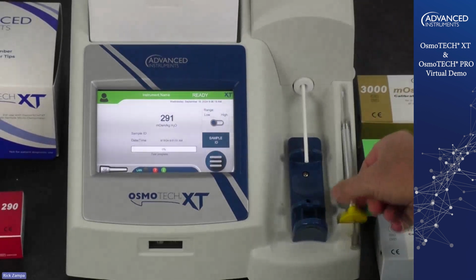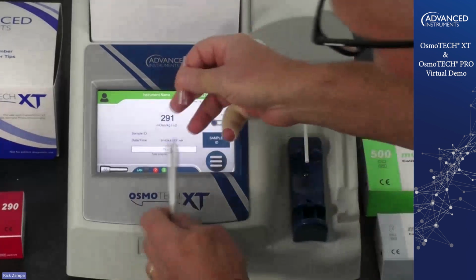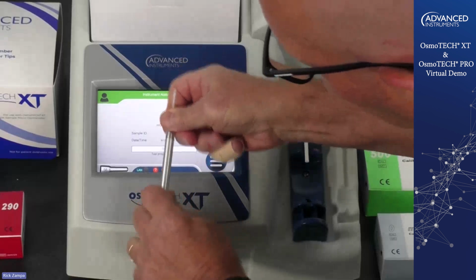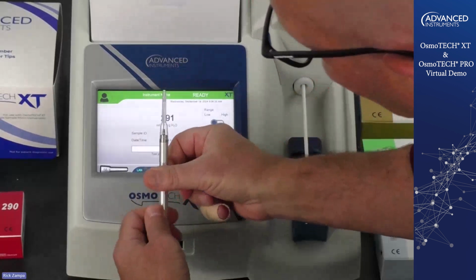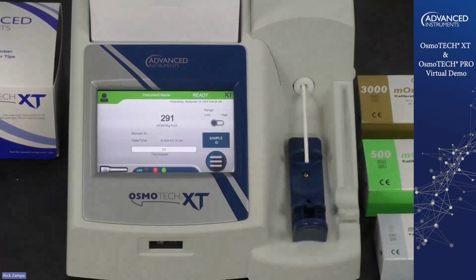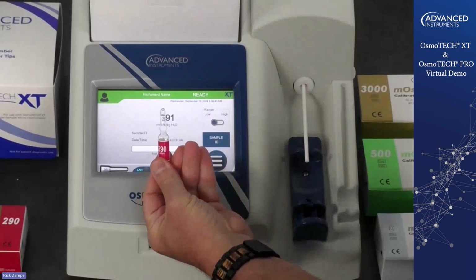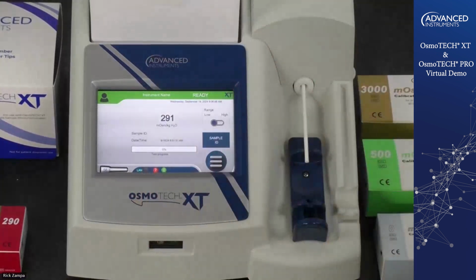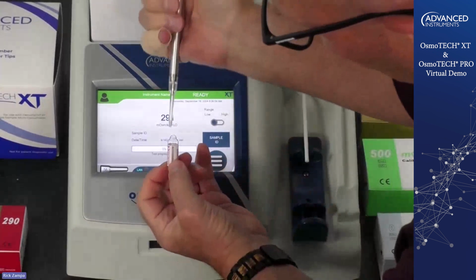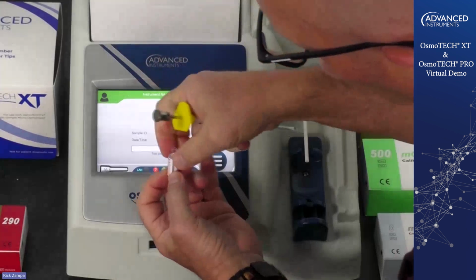So what I'm going to do is take the sampler here. I have my sampler. I'm going to take one of the sample tips here, and I'm going to slide it onto the sampler, and it will snap into place. Sometimes you can hear it snap into place. You just want to make sure that it's all the way sealed around the bottom. I'm going to grab an ampule of my 290 reference solution here. To draw up the sample, I'm going to put the sampler in with the plunger down. I'm going to wet the sample tip to assure I get a good sample. I'm going to draw that out.